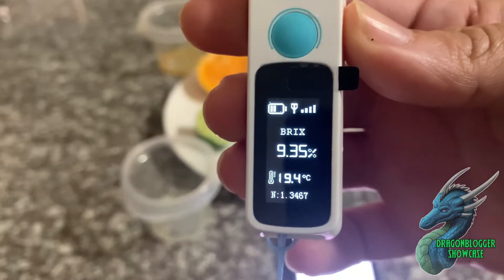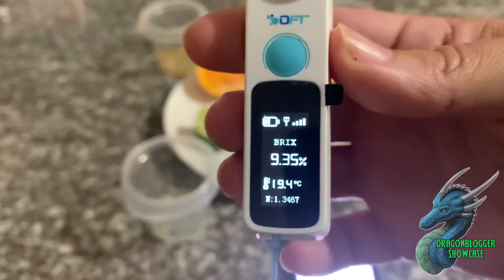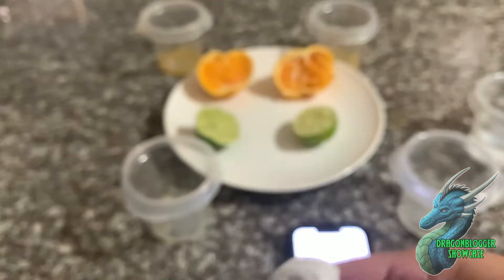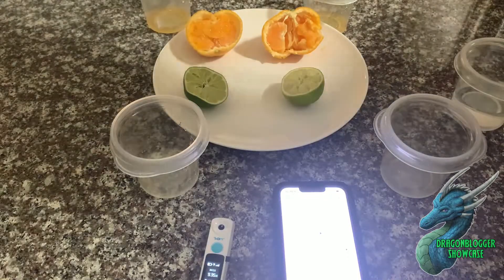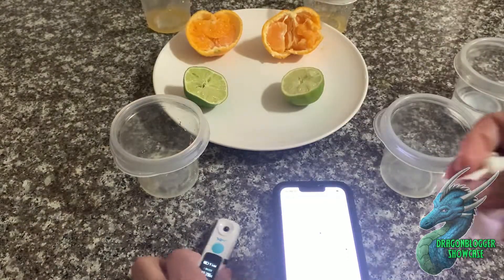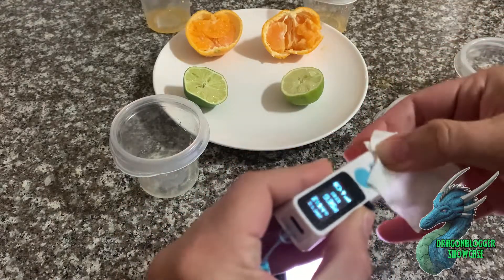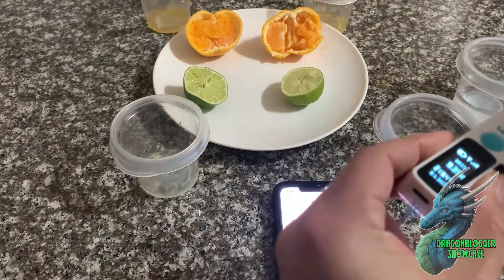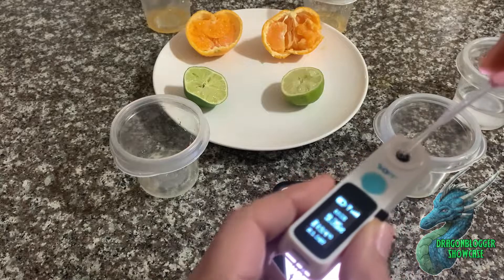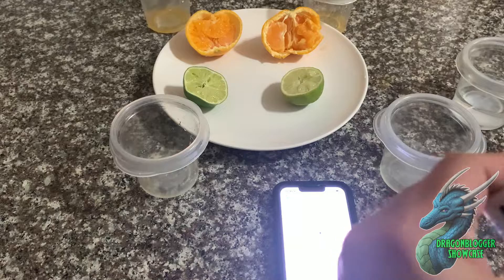The Brix percentage, as you can see, is 9.35 percent, and it even shows you the temperature of the liquid placed on there, which I think is cool. That was the less ripe one. Now I'm going to take the little cloth they gave me and wipe off the sensor so it's good to go again — you don't want any contamination from the last test. I'm also going to put some clear water on there and wipe it again to ensure it's not contaminated for the next test.